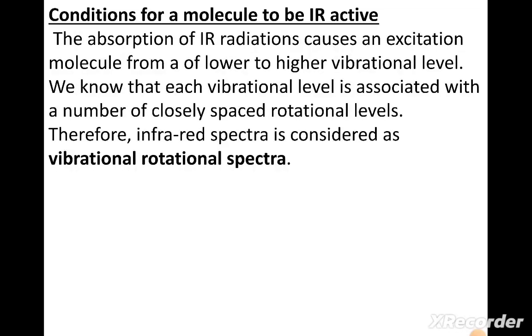The absorption of IR radiations causes an excitation of a molecule from a lower to higher vibrational level. We know that each vibrational level is associated with a number of closely spaced rotational levels. Therefore, infrared spectra is considered as vibrational rotational spectra.